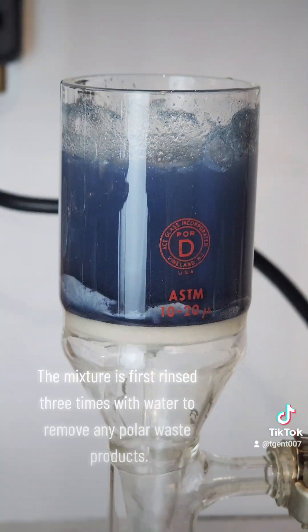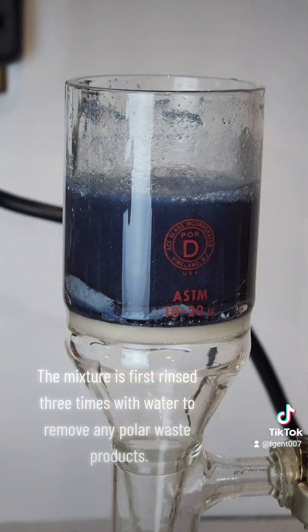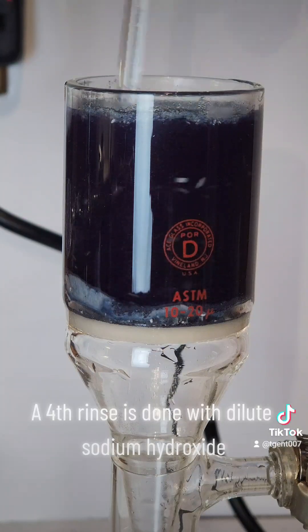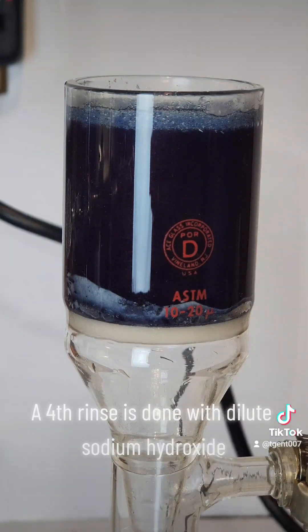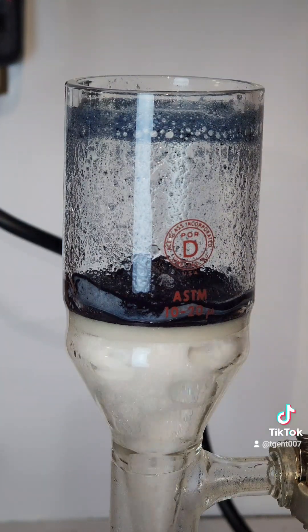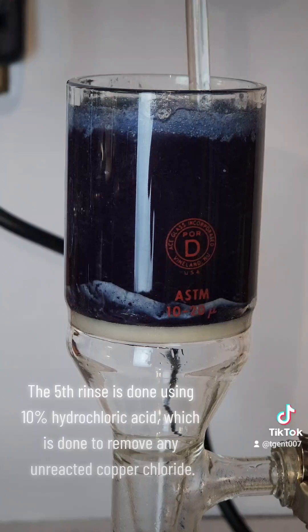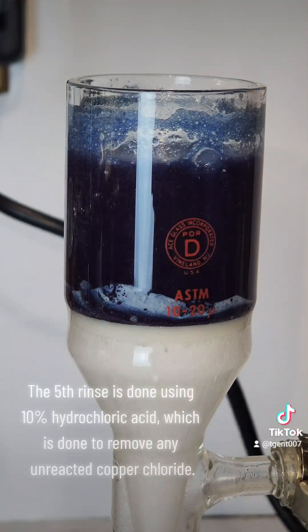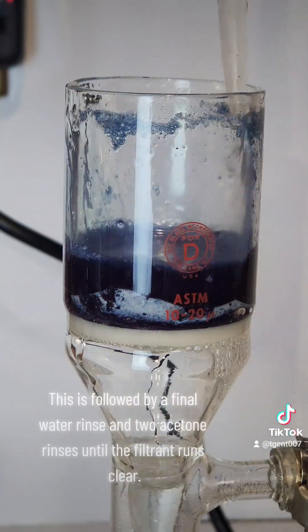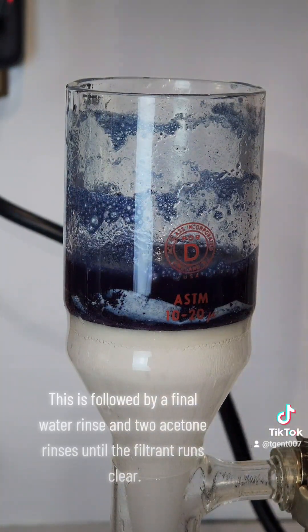The mixture is first rinsed three times with water to remove any polar waste products. A fourth rinse is done with dilute sodium hydroxide. The fifth rinse is done using 10% hydrochloric acid, which is done to remove any unreacted copper chloride. This is followed by a final water rinse and acetone rinses until the filtrate runs clear.